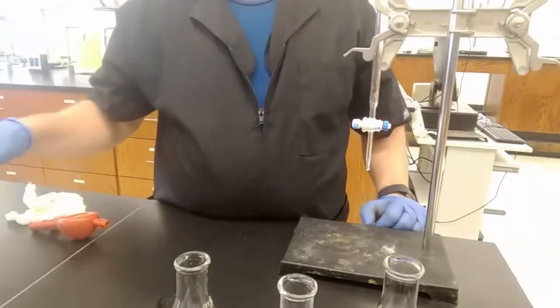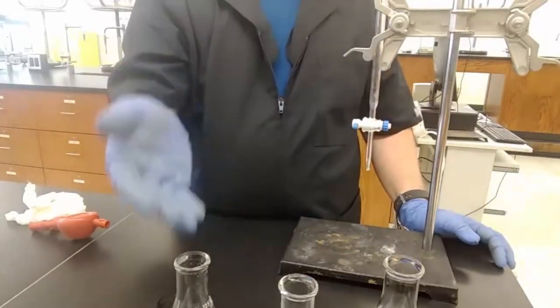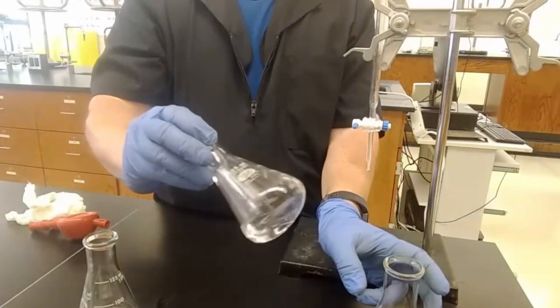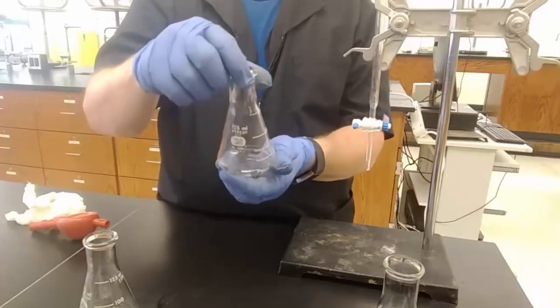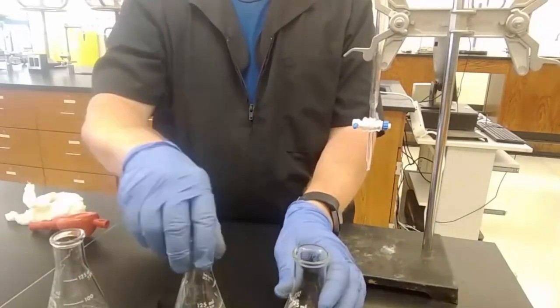Step three, we're recording 10 milliliters as our volume of acid used, because we did. We had 10 milliliters, 10 milliliters, 10 milliliters in each of these three flasks. So there's nothing different about the flask, and that's why we didn't need to renumber them, or number them at all. Just getting a drop that was on the sides, wash it down in there, but we'll carefully do this anyway as we go along.